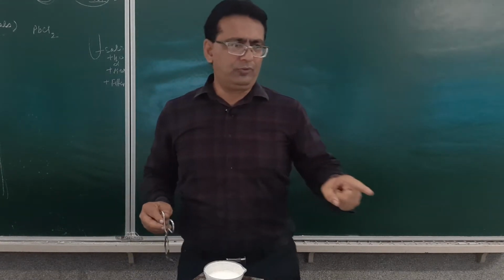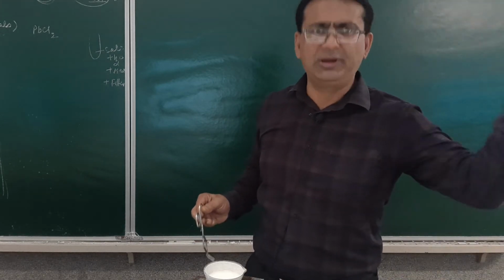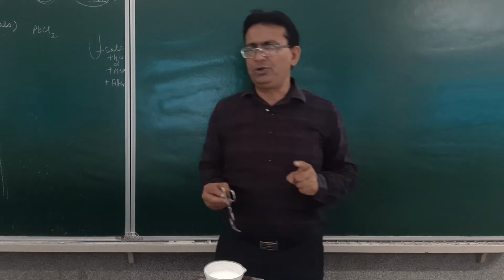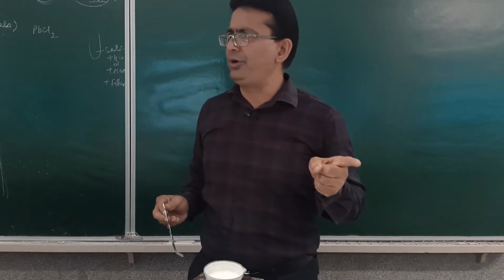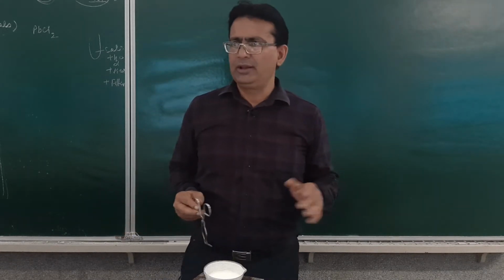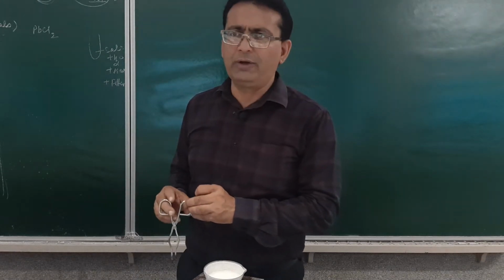Ferrous sulphate solution, for me it is kept over here, for you people it is kept over there. Today it will also be kept over there, because it is the last demonstration of mine in this lecture. Then to this we will add ferrous sulphate solution and then concentrated sulfuric acid from the side of the test tube. When we add concentrated sulfuric acid from the side of the test tube, what do we observe?